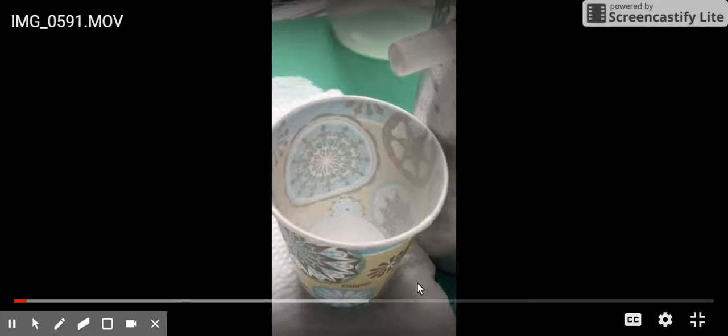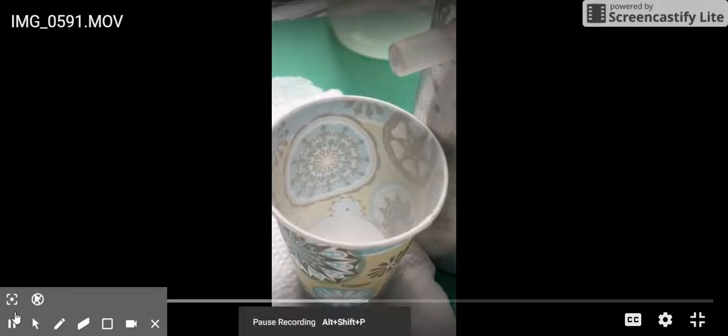I put paper towel underneath when I filled it just in case there were drips. I don't want to have any drips coming off. It should be dry, and place a dry container at the base of the exit tube on your table.